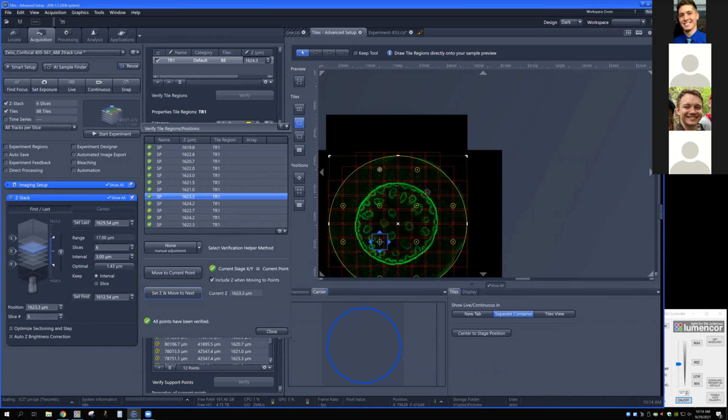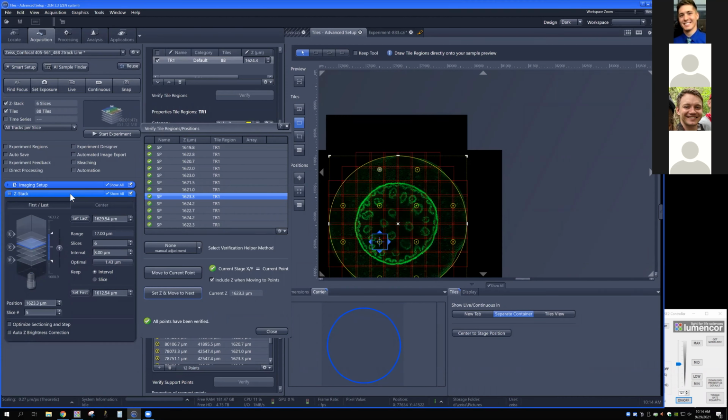That's the basics, I would say. The only other thing that I'll mention, I suppose, is this might be a good time. Well, let's see, what time are we at? 10, wow, we're already at 10:14. It might make more sense to talk about a couple of other focus strategies here. And I think we might do carriers this afternoon, even though we have this one that we should put in the fridge, right? Sort of. Okay, we can do that after we're done with the focus maps like we were going to anyway. All right, so we'll save carriers for this afternoon because I think that is a bit of a longer conversation and we technically have 15 minutes before the end of this.